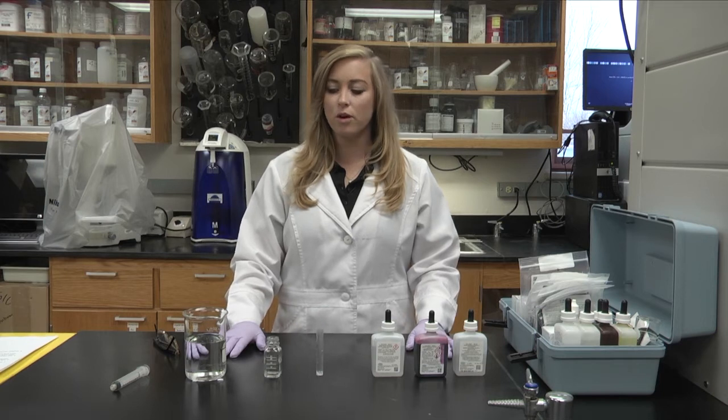Hi, I'm Catherine Mitchell. I work for Kentucky State University as an Aquaculture Extension Associate, and today I will be showing you how to test for water quality.